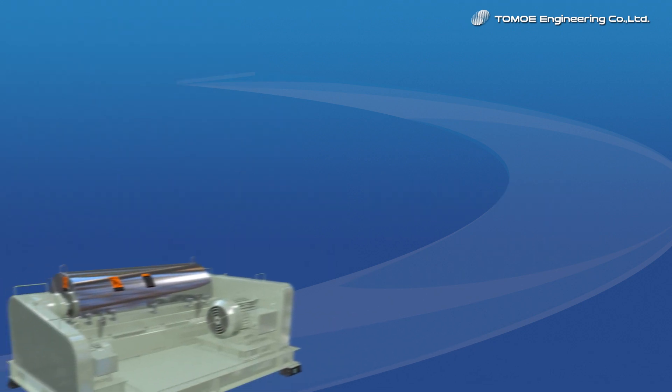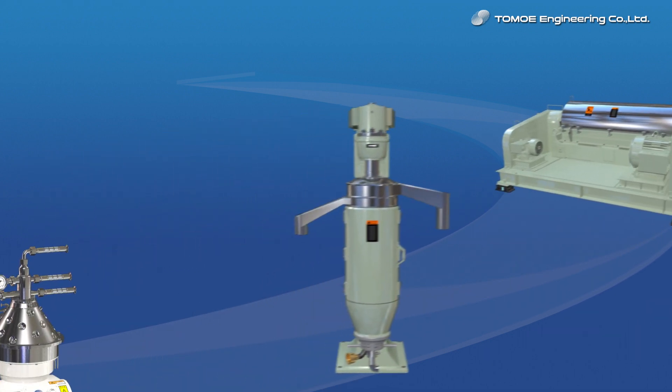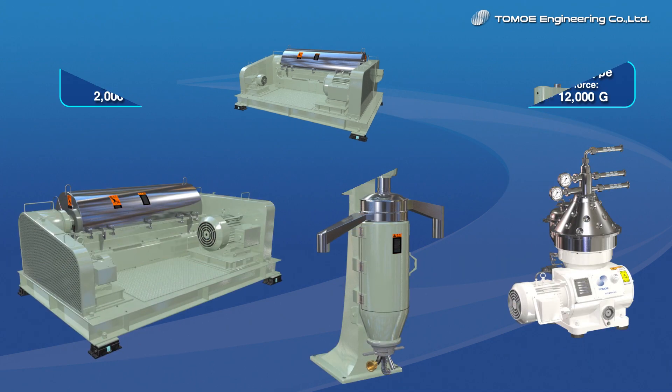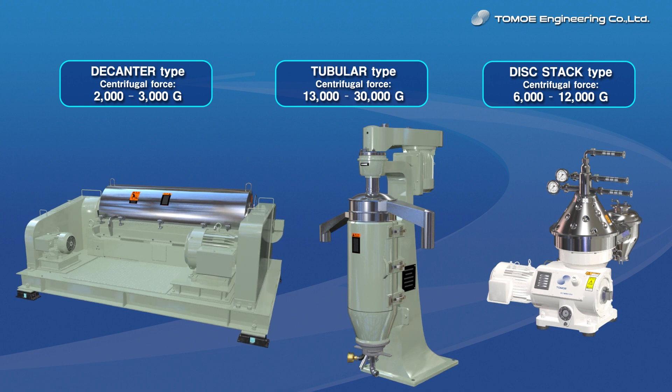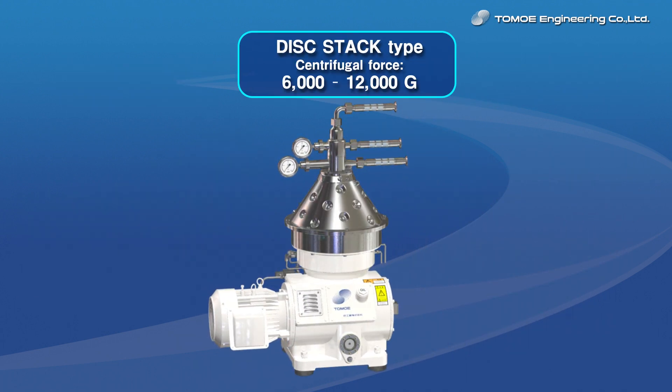Tomoe Engineering has prepared various types of centrifugal separators, such as decanter type, tubular type, and disk stack type depending on your application. We would like to introduce you particularly to the disk stack type centrifuge in this video.